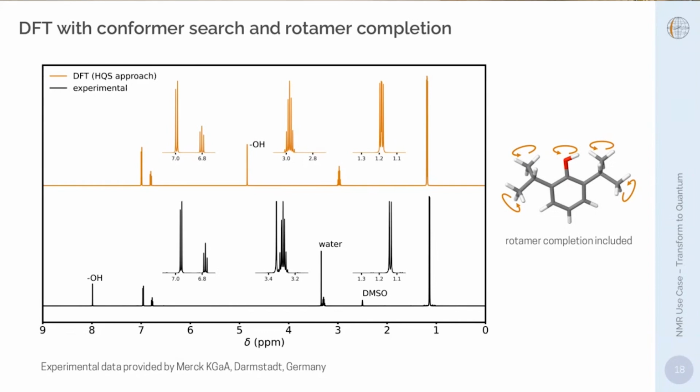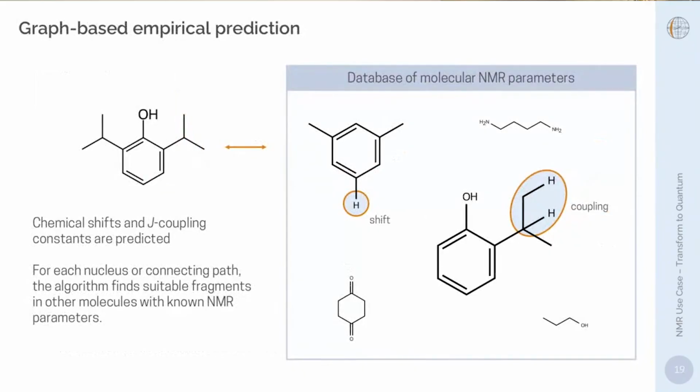So this is so far so good. This is what you can achieve if you employ a good workflow that makes use of DFT. But maybe sometimes you don't want to go through all the complexities, so maybe you want to use data-driven methods, and what we are developing are graph-based empirical prediction techniques.